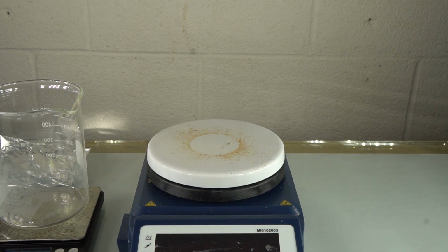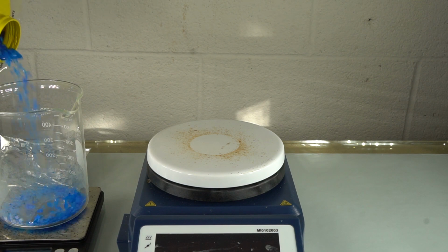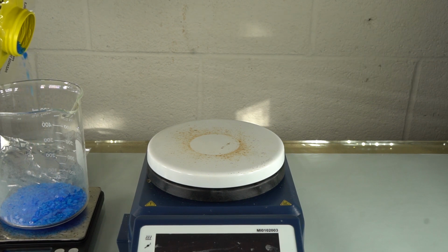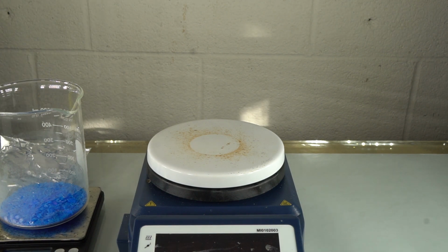50 grams of copper sulfate. It doesn't need to be exact. 15, 20, 30. Okay, that's just about 50 grams. It's about 50 grams of copper sulfate. That is going to give us a really nice blue solution.